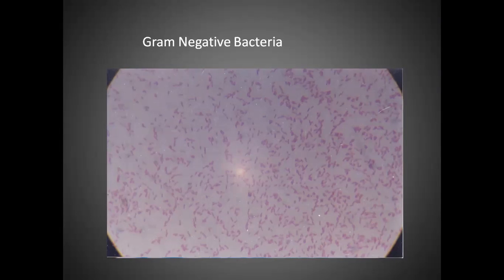Some bacteria possess 20 to 80 nanometer thickness of peptidoglycan, a polysaccharide present in the cell wall of bacteria, whereas very few bacteria contain just 2 to 8 nanometer of peptidoglycan in their cell wall. So that is the reason.